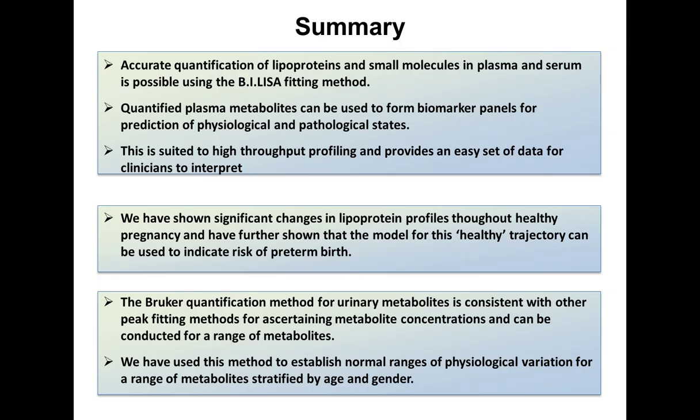To summarize, what I hope I've shown you is that the accurate quantification of lipoproteins and small molecules in plasma and serum is possible using the BI-LISA fitting method. These quantified metabolites can be used to form biomarker panels for prediction of physiological and pathological states, and is highly suited to high-throughput profiling. Clinicians, we found, don't like profiling data because they don't understand it, so what they want is a set of quantified metabolite values, and this is what we can now deliver to them.